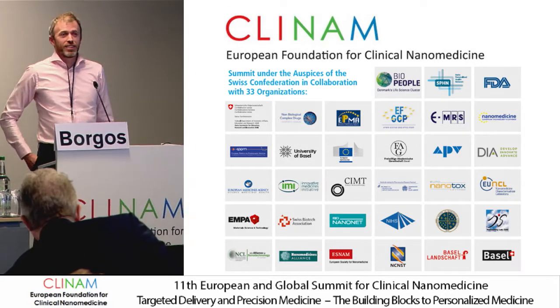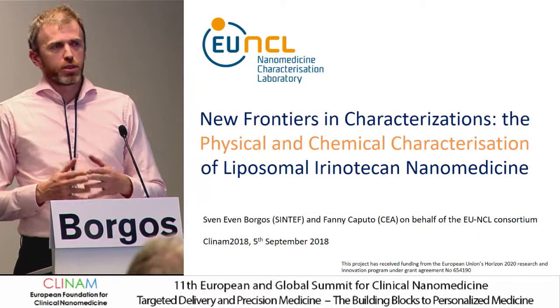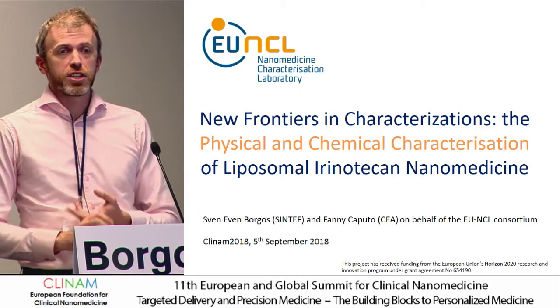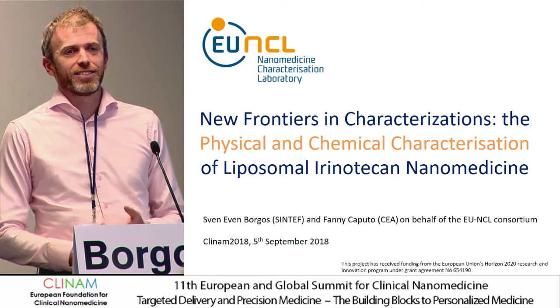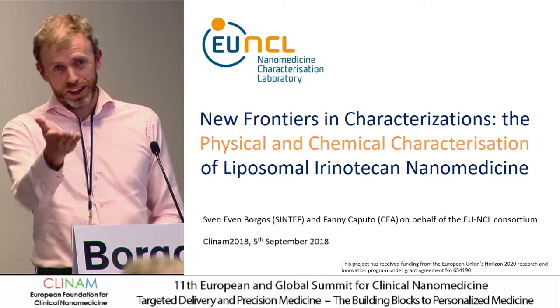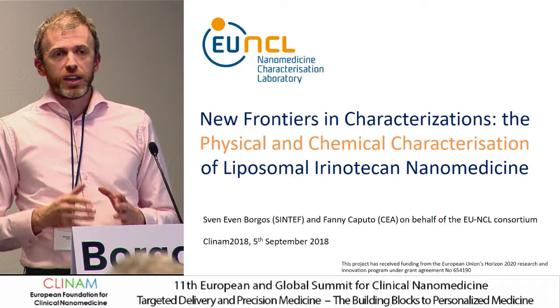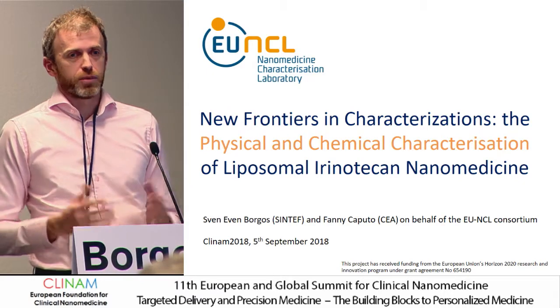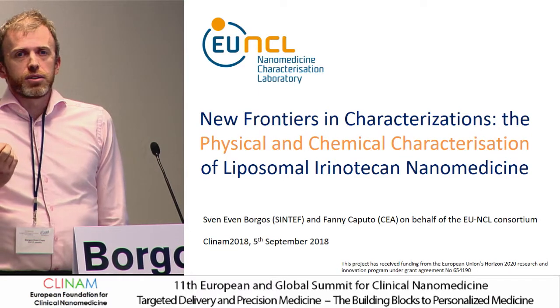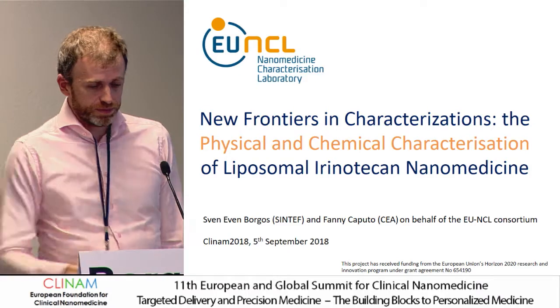Thank you, Patrick, and thank you everyone for coming. As Patrick mentioned, we're going to split this session in two. First I'm going to tell you a little bit about physical and chemical characterization, and that's also going to be a composite because the slides on physical characterization were provided by Fanny sitting at the front here. Afterwards, Neil is going to go to the in vitro and in vivo side of things, and we're going to try to tie it a bit together. So we decided to look at a case study of liposomal irinotecan.